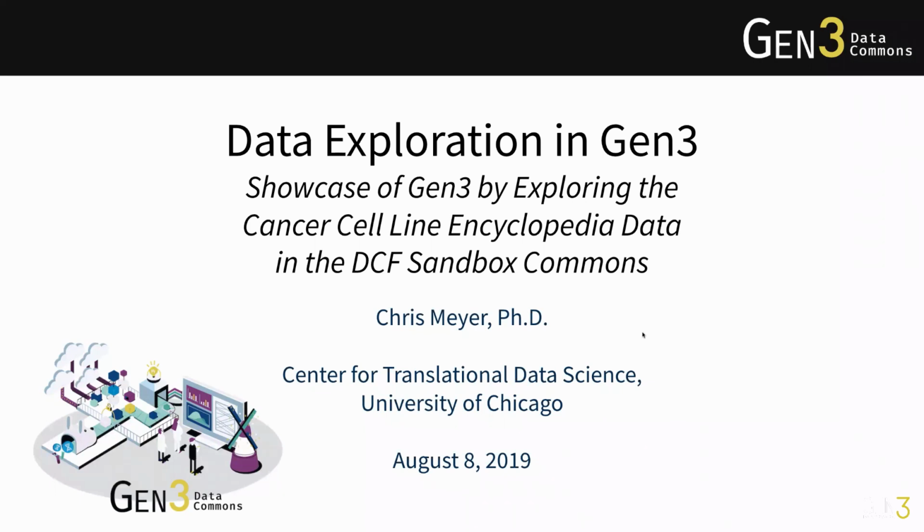Thank you, Trevor, and thank you, webinar participants. I will go ahead and get started with the presentation by sharing my screen. The topic of today's webinar is data exploration in Gen3. And today we'll be showcasing the Gen3 services by exploring the Cancer Cell Line Encyclopedia data in the DCF Sandbox Commons.